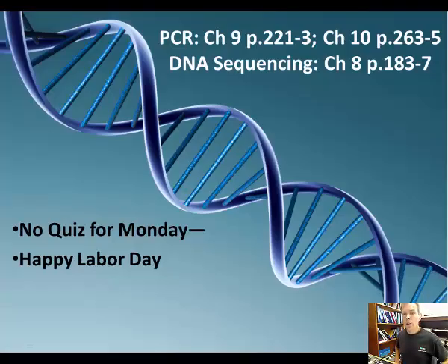Hi everyone, this is lecture 6. This is going to be an extension of DNA replication, but focused on the techniques of PCR and DNA sequencing, which are both extensions of DNA replication.